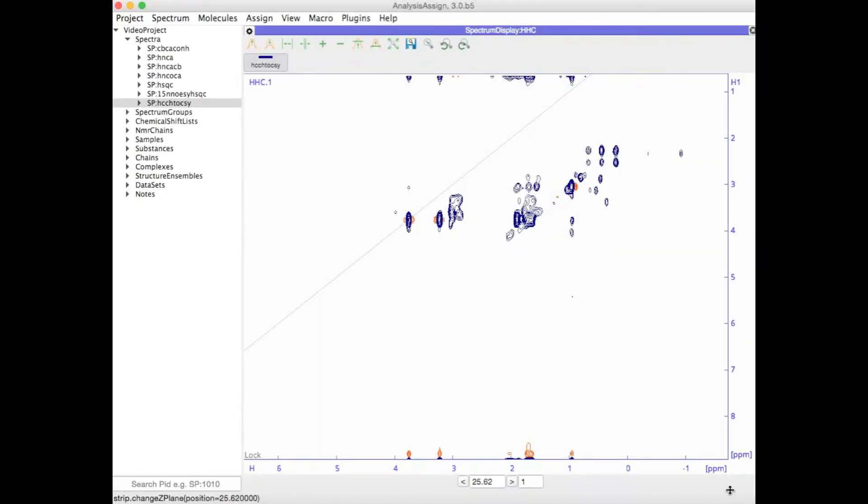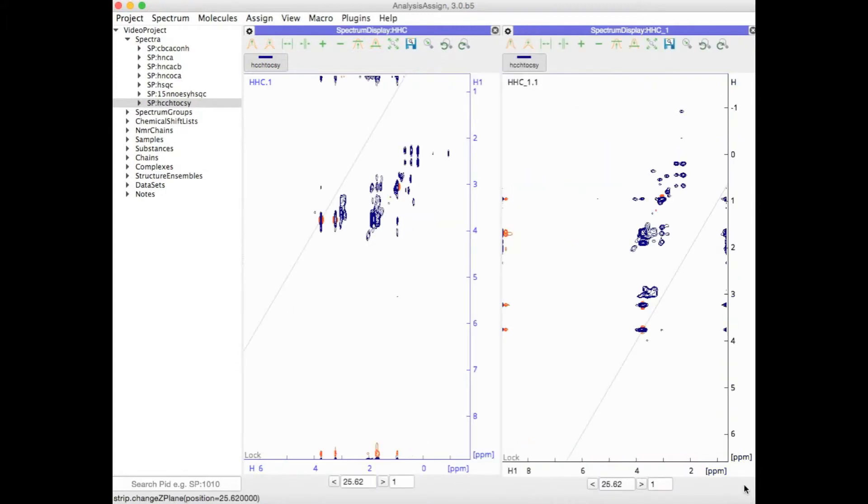Do you have a spectrum like an HCCH TOCSY where you would like to flip your axes? Simply type XY and your axes have been flipped.